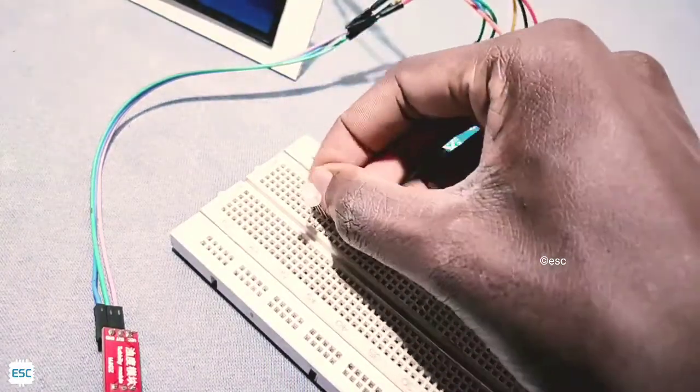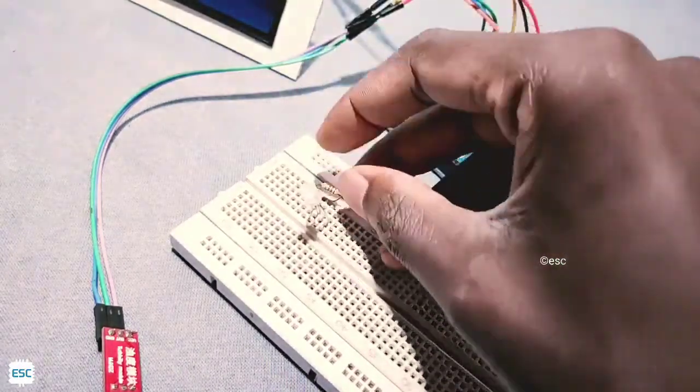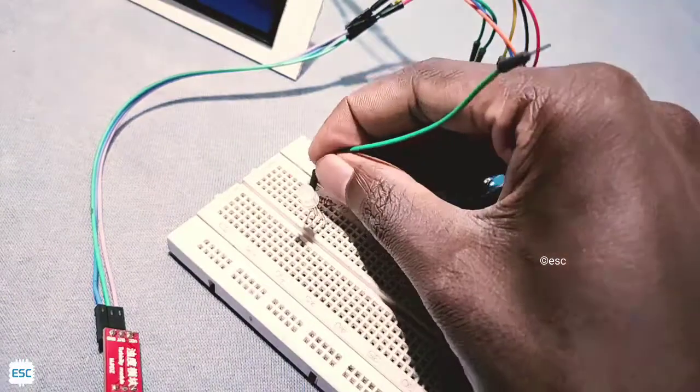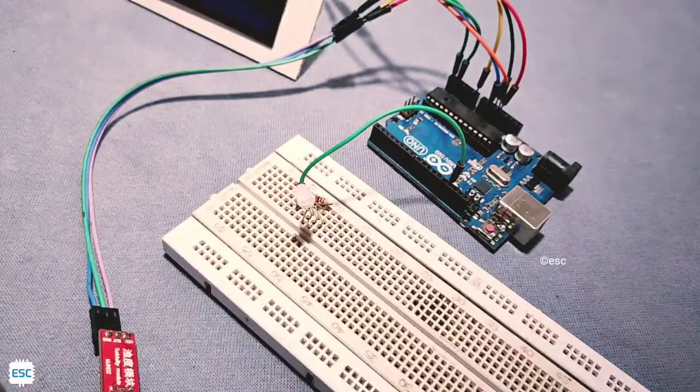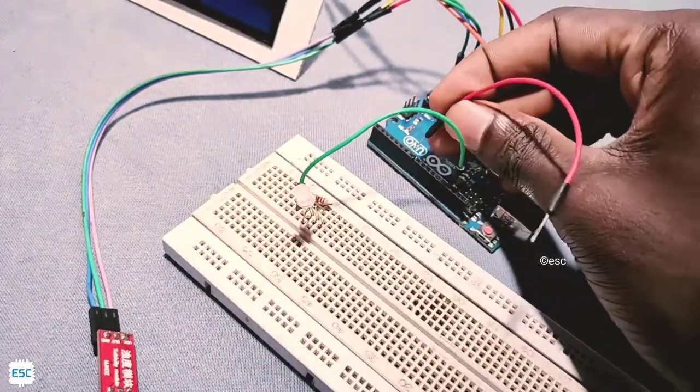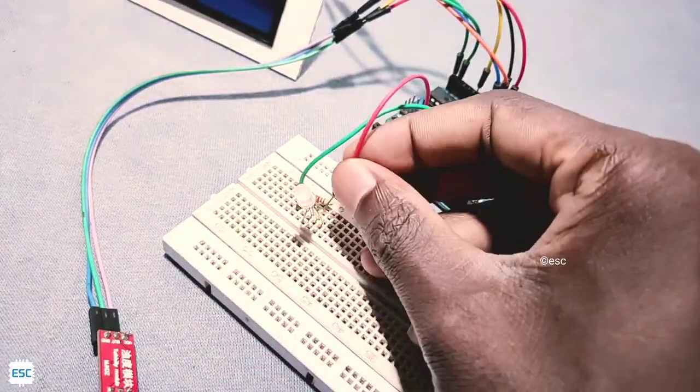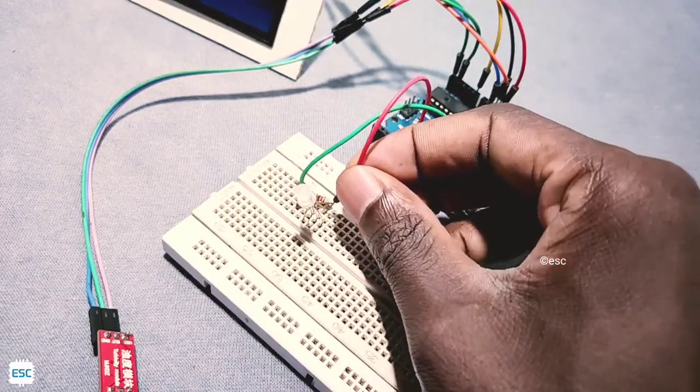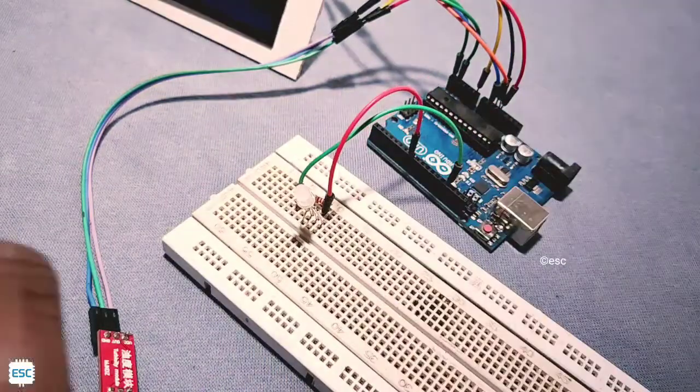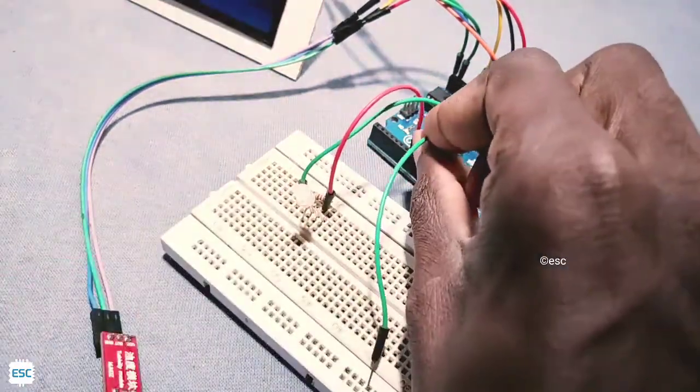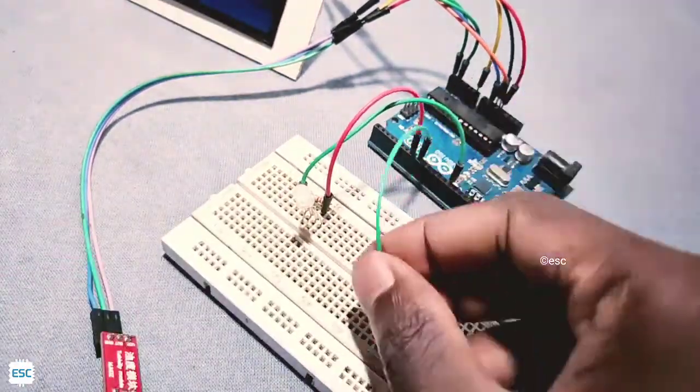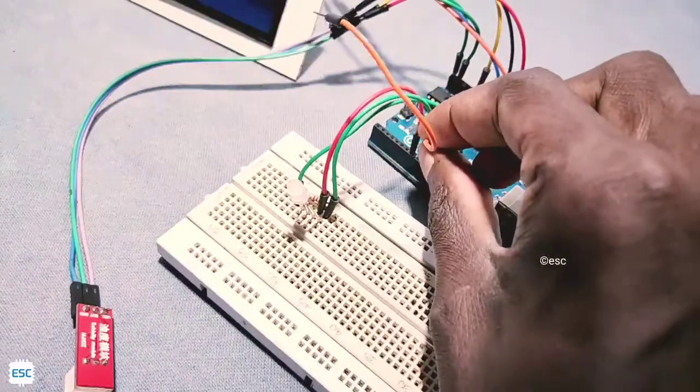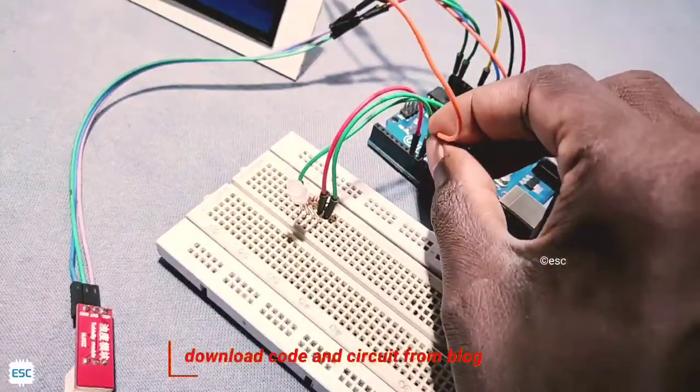Finally connect RGB LED to Arduino. First connect ground to ground, then green to pin 7, blue to pin 8 and red to pin 10.